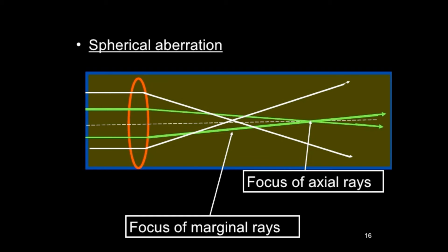Wavelength for electrons at 300 keV is approximately 0.02 angstroms. So we never get 0.02 angstrom resolution because of this effect. So the best resolution that people get in material science, where they don't have to worry about radiation damage, is something like maybe 0.7 angstroms. It's in that area. We'll never get there in biology because of the radiation damage.